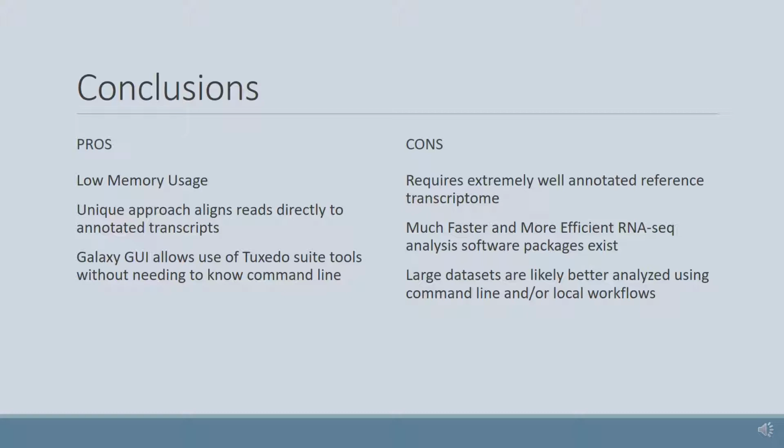So I would recommend it to whoever, and whenever you're using RNA-seq, if you feel like you've had a good reference transcriptome, Tuxedo Suite is the way to go. All right.